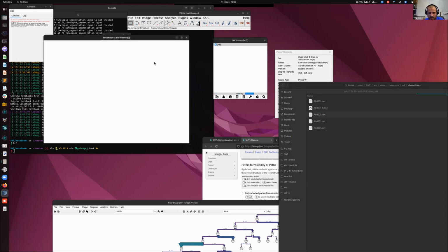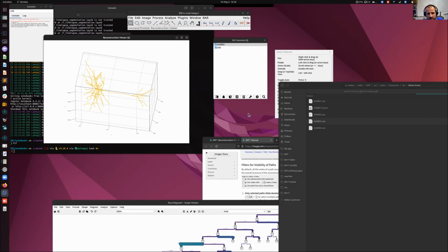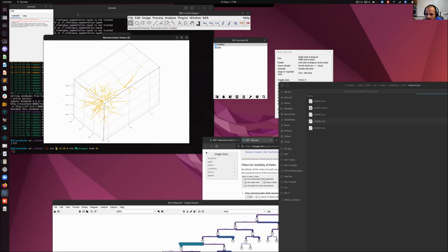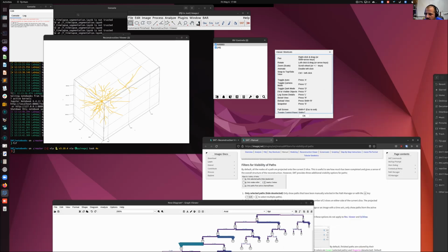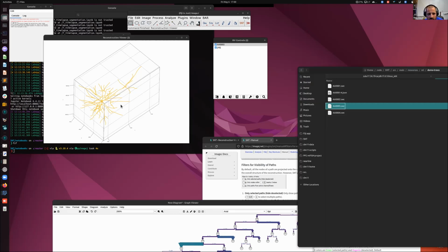Okay, so that was just going to load another neuron. Okay, let's go to drag and drop. Okay, yeah, so in this case, I just drag and drop, and you can draw meshes if you have. So the supported meshes we have are OBJ files. In this case, I just loaded the file. The thing with the JSON is that it's an old format from our database that was never in production, and I shouldn't have dragged and dropped it. Okay, and that's the same idea.